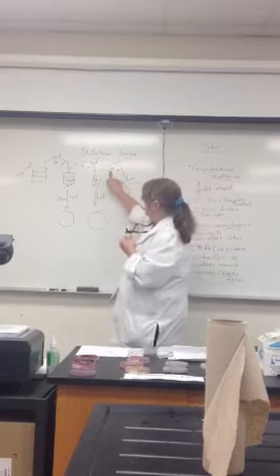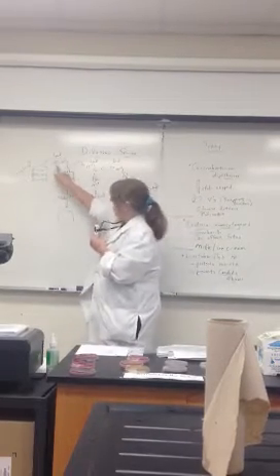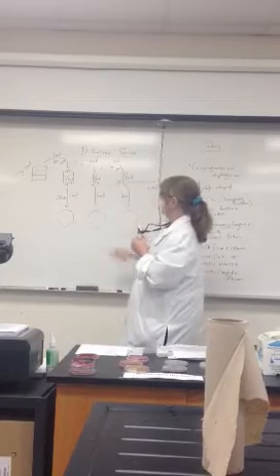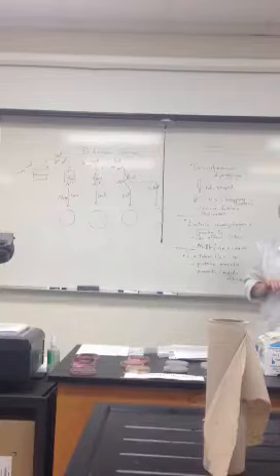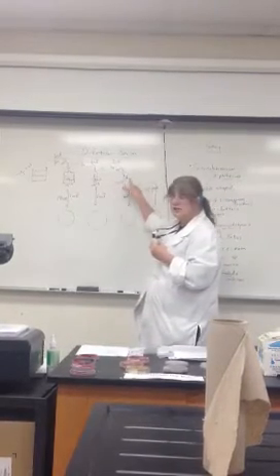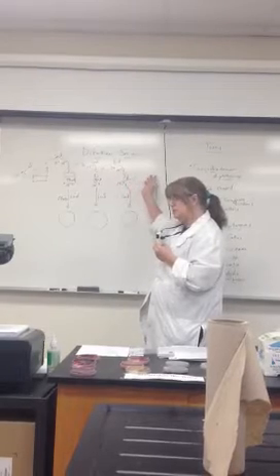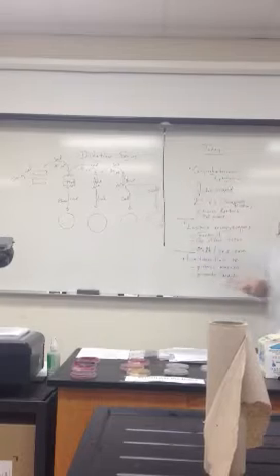If you plate another 1 to 10, remember you're decreasing the organisms, it is 1 over 100 times 1 to 10 times 1 to 10, or add zeros, is 10 to the minus 4. Okay, 10 to the minus 4 in this last test tube. Yeah, that's the dilution factor. Plate 1 mil stays the same on the plate.